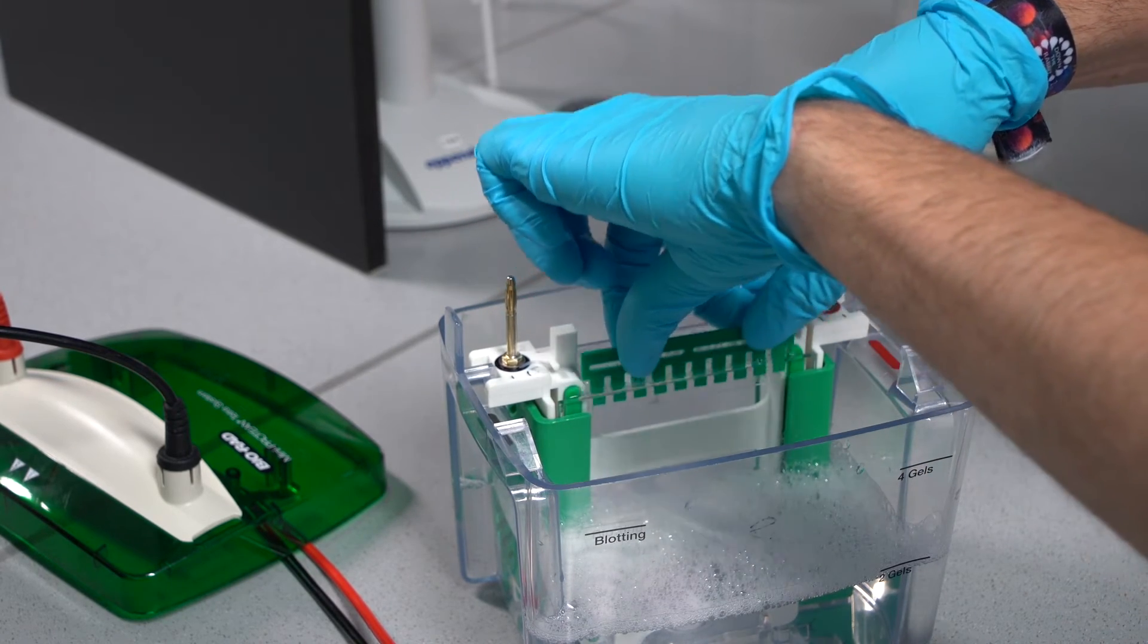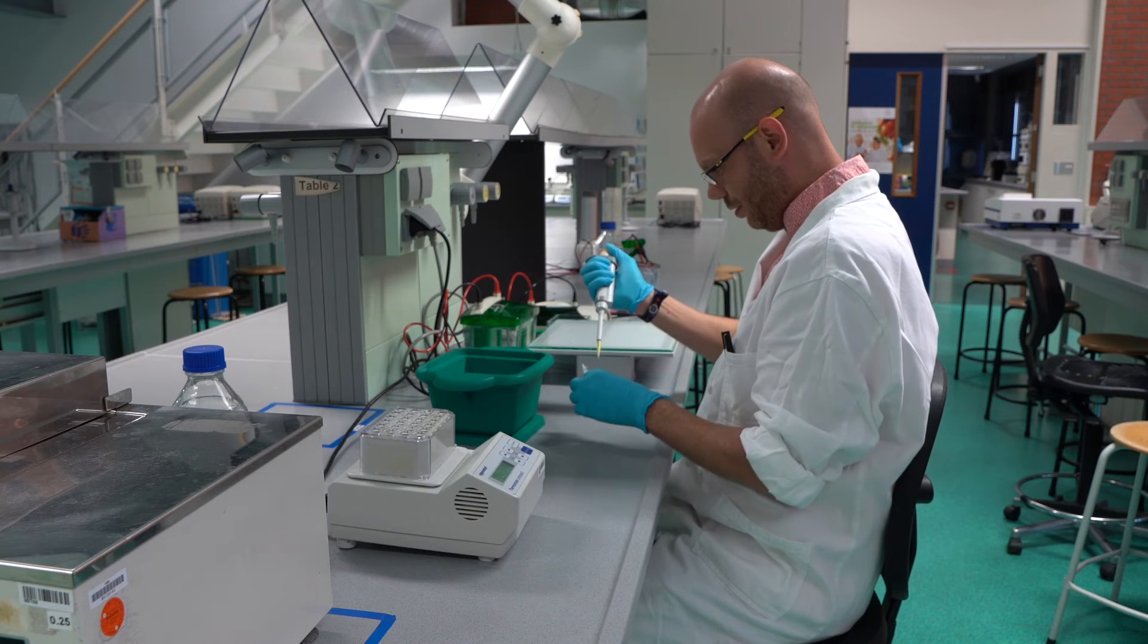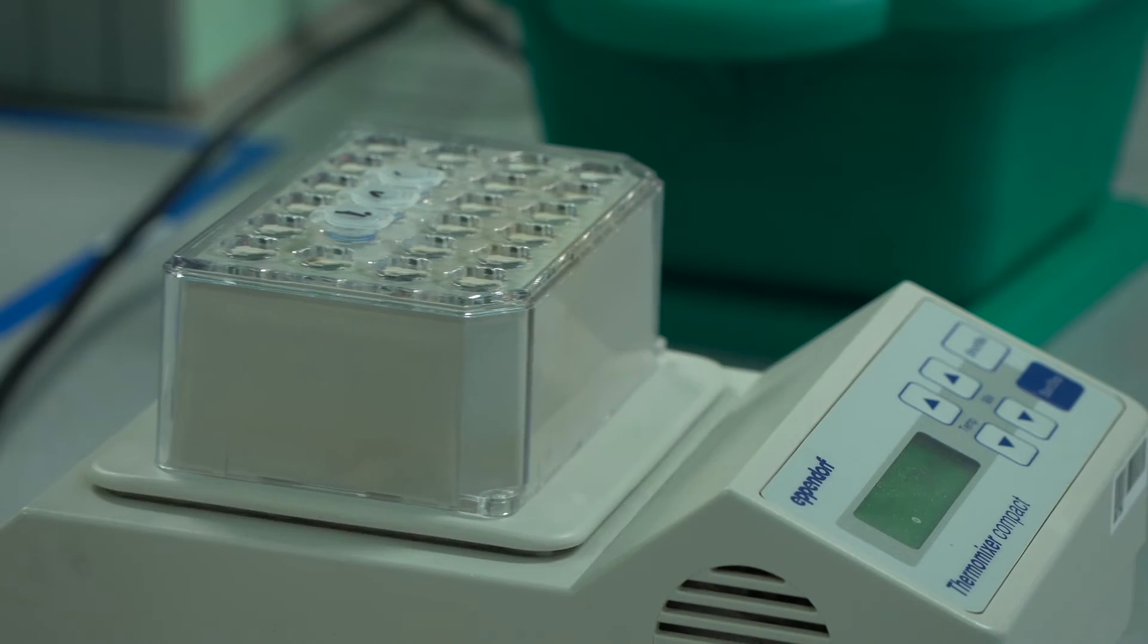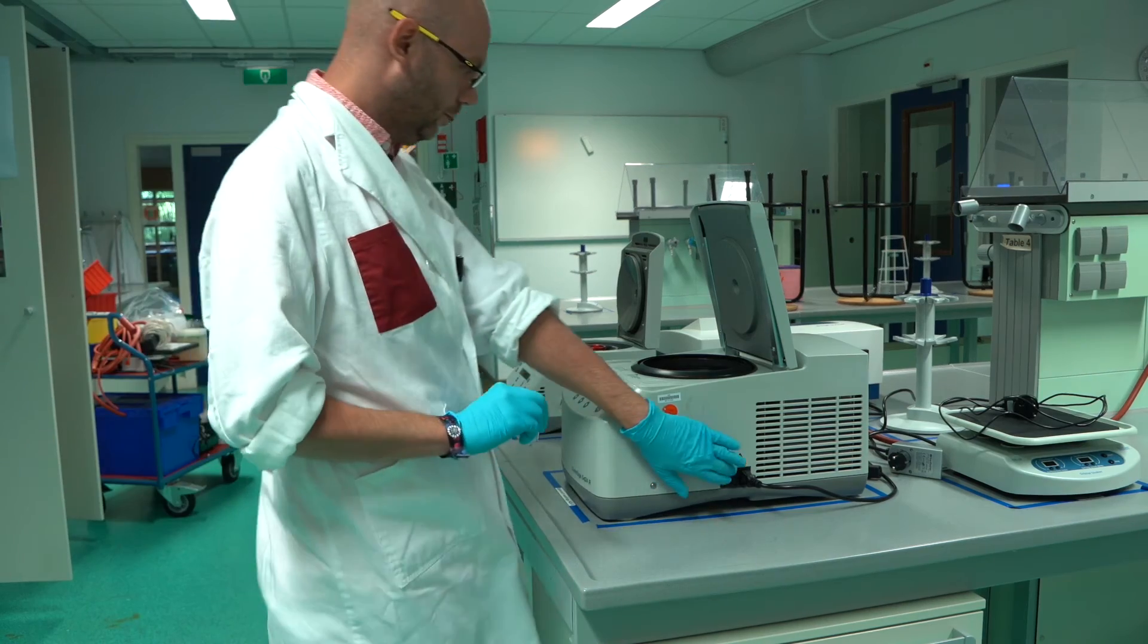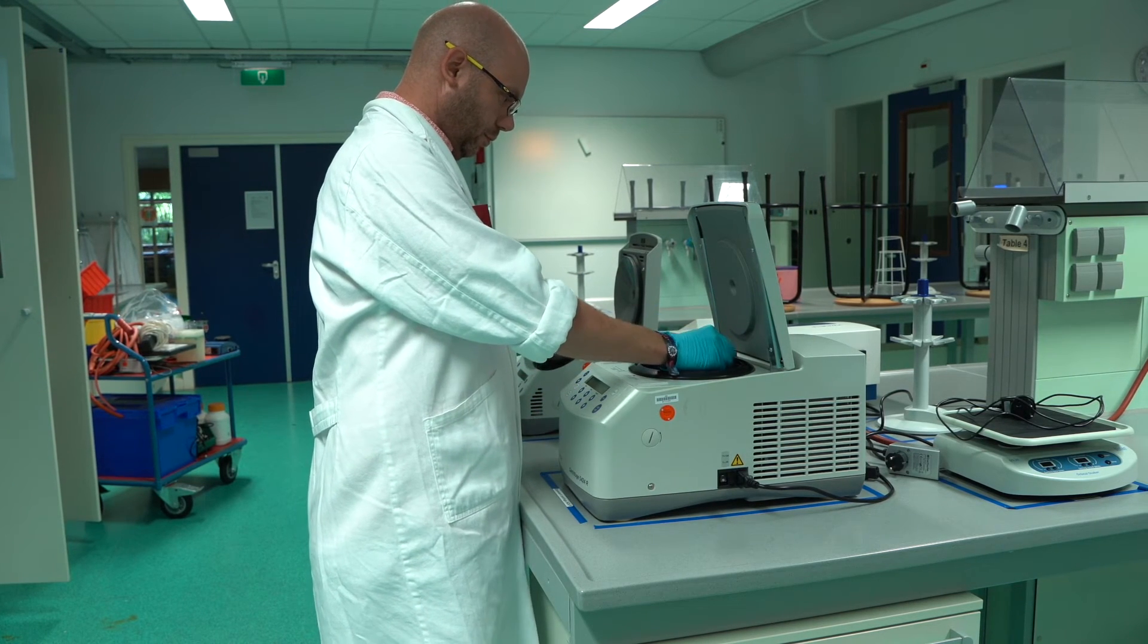Carefully remove the comb from the gel. To prepare the samples, boil them for 5 minutes at 95 degrees C in the sample buffer. You can use a heating block for this. After heating, spin briefly by means of a short spin at 14,000 RPM in a centrifuge.